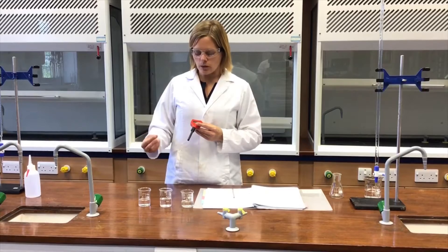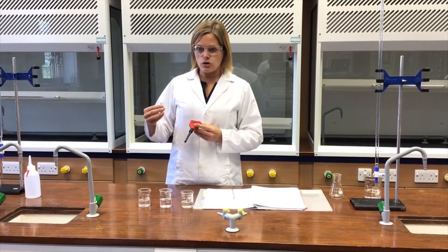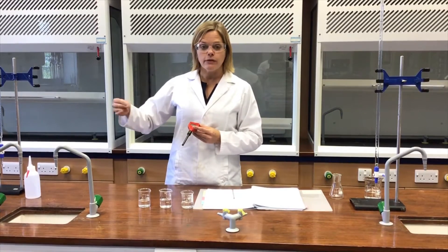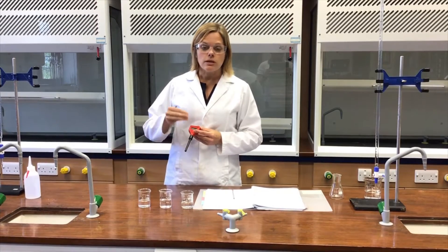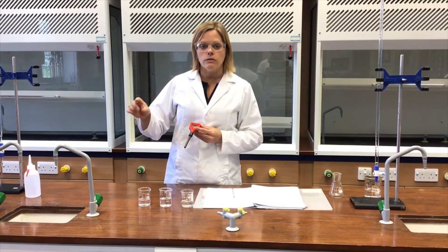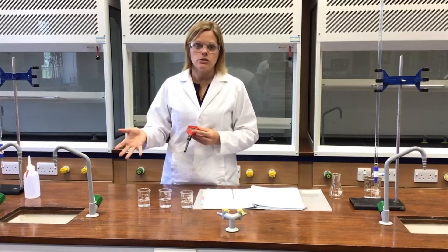When we do calibration, what that involves is taking some known measurements carefully and recording what the readout says, then producing a calibration curve so that the readout can then be converted to a true value.